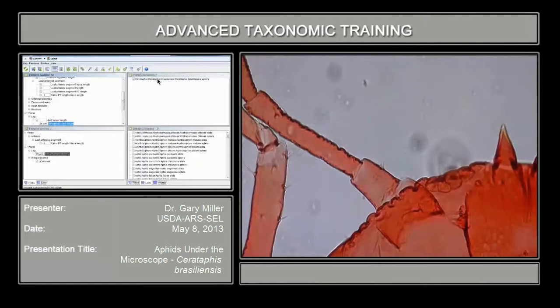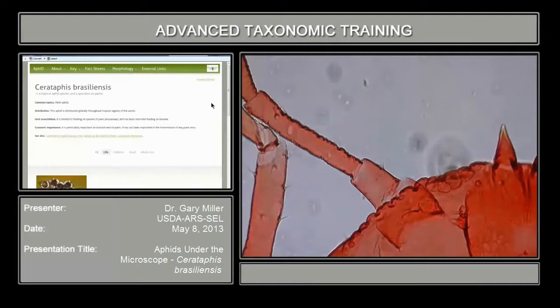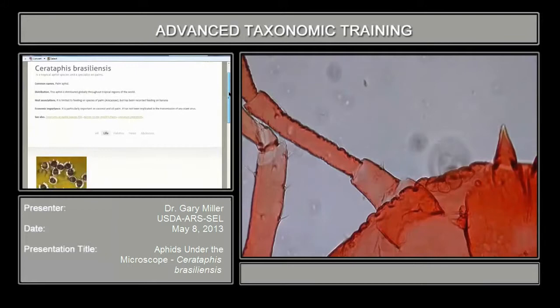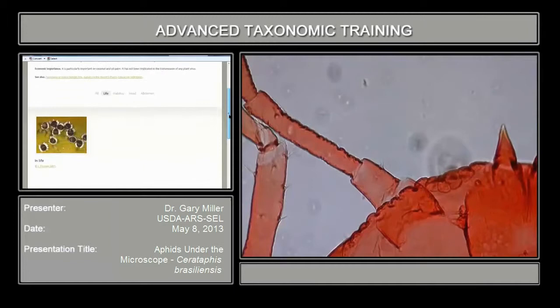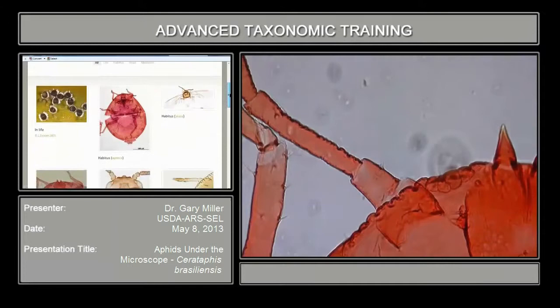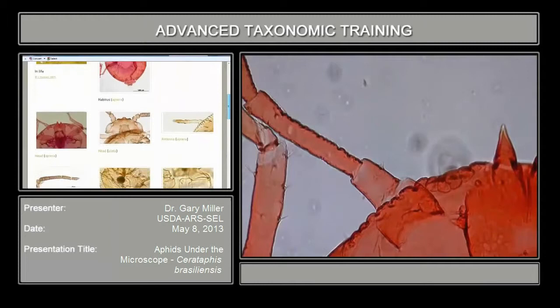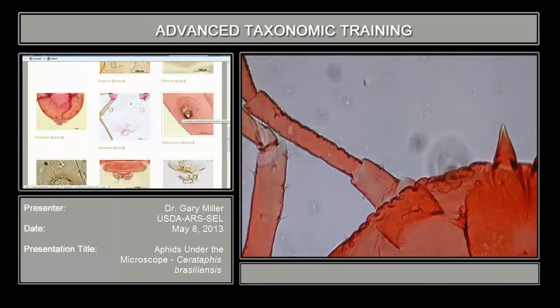My colleague Susan mentioned this is a good opportunity to say what this species does if it gets on palms. It's called the palm aphid. I clicked on the link and it takes me to the fact sheet with a little bit about its host and general distribution. It's particularly important on coconut and oil palms, and it has not been implicated in the transmission of any diseases. Here you can see what the specimens look like. This is also a good opportunity to check yourself — the siphunculi are greatly reduced in this particular species.